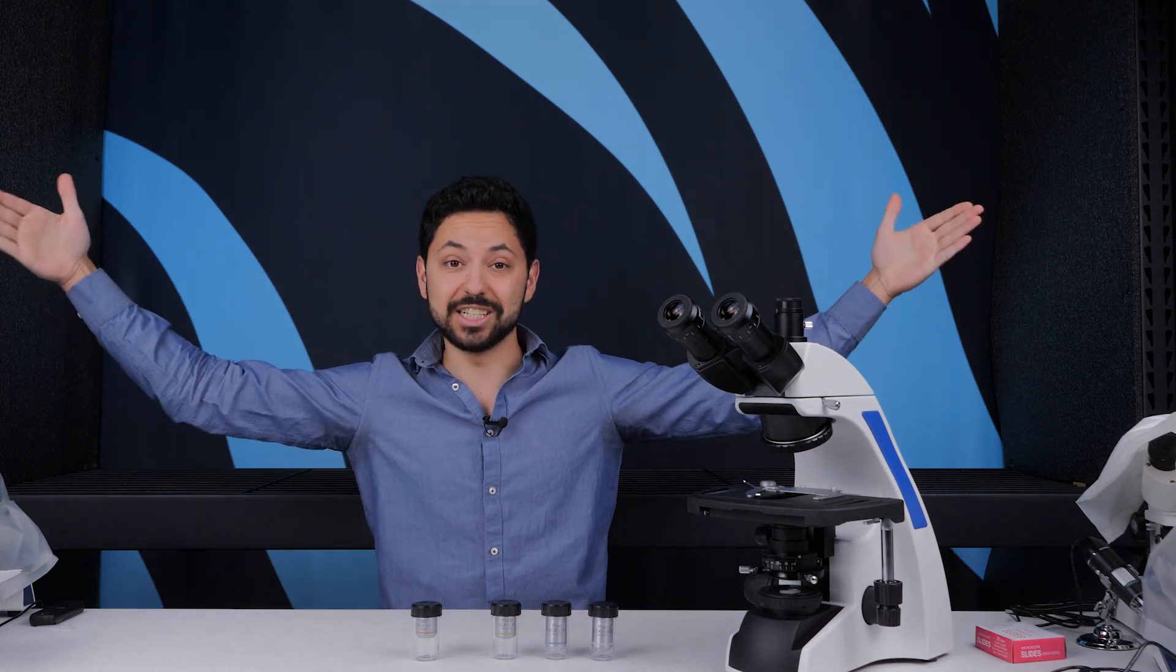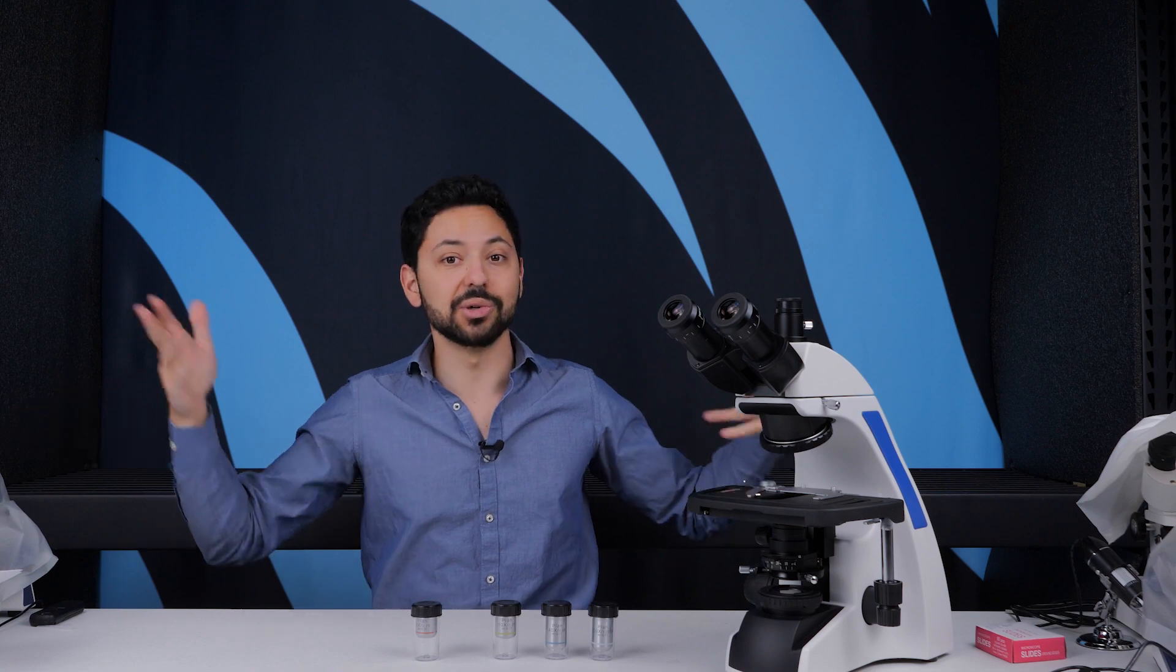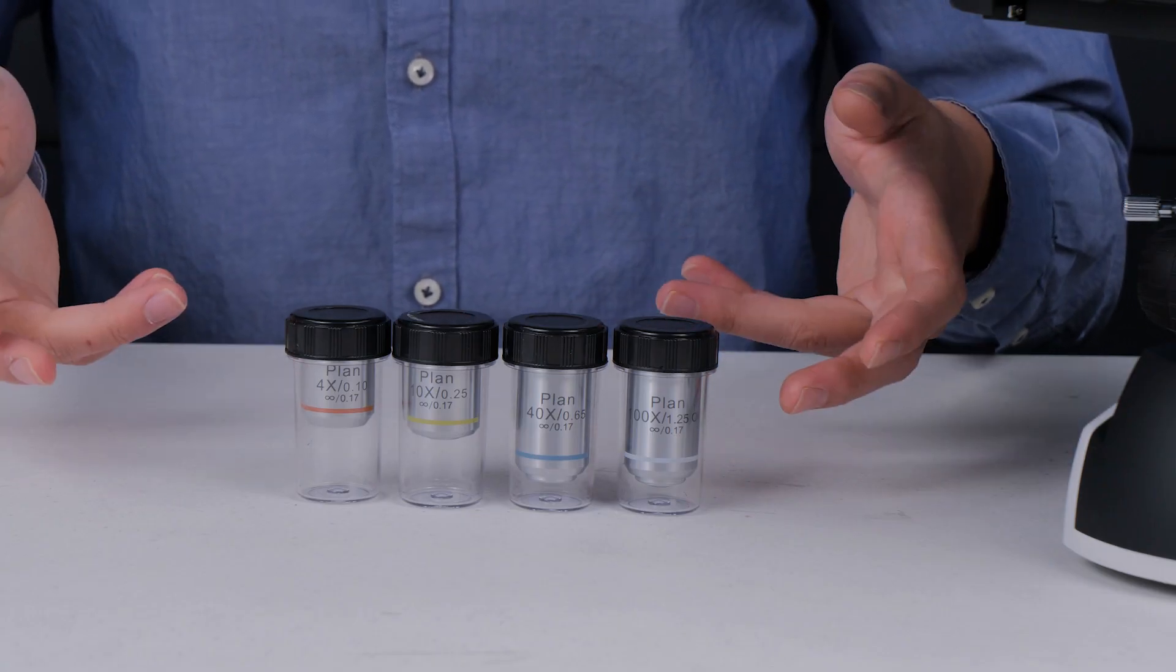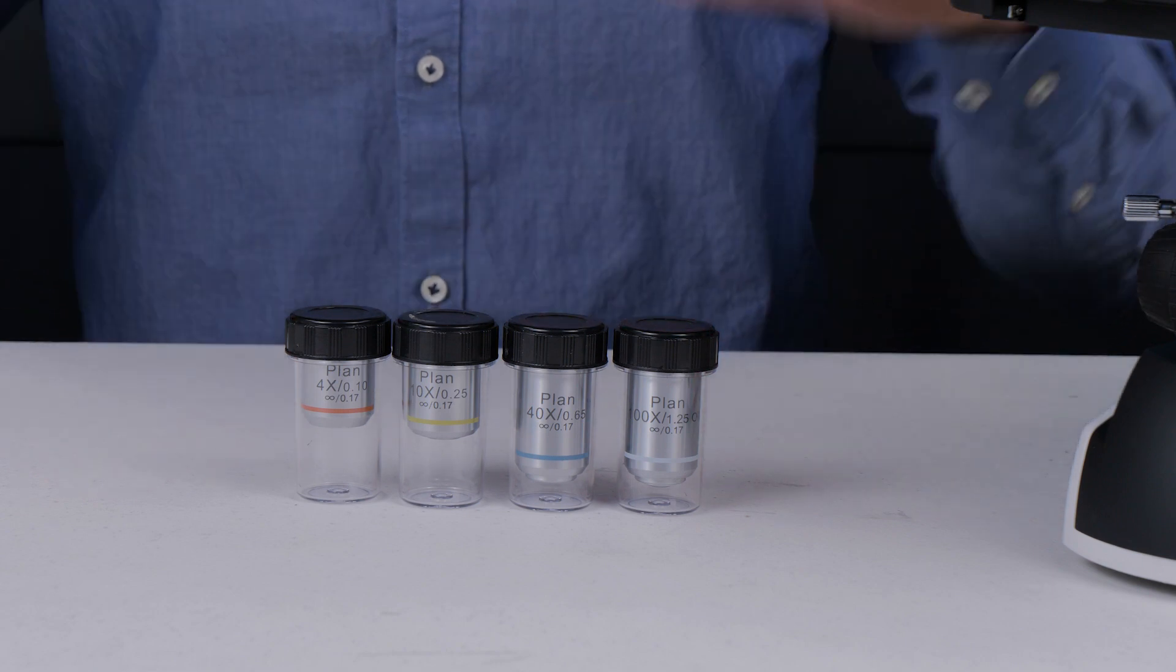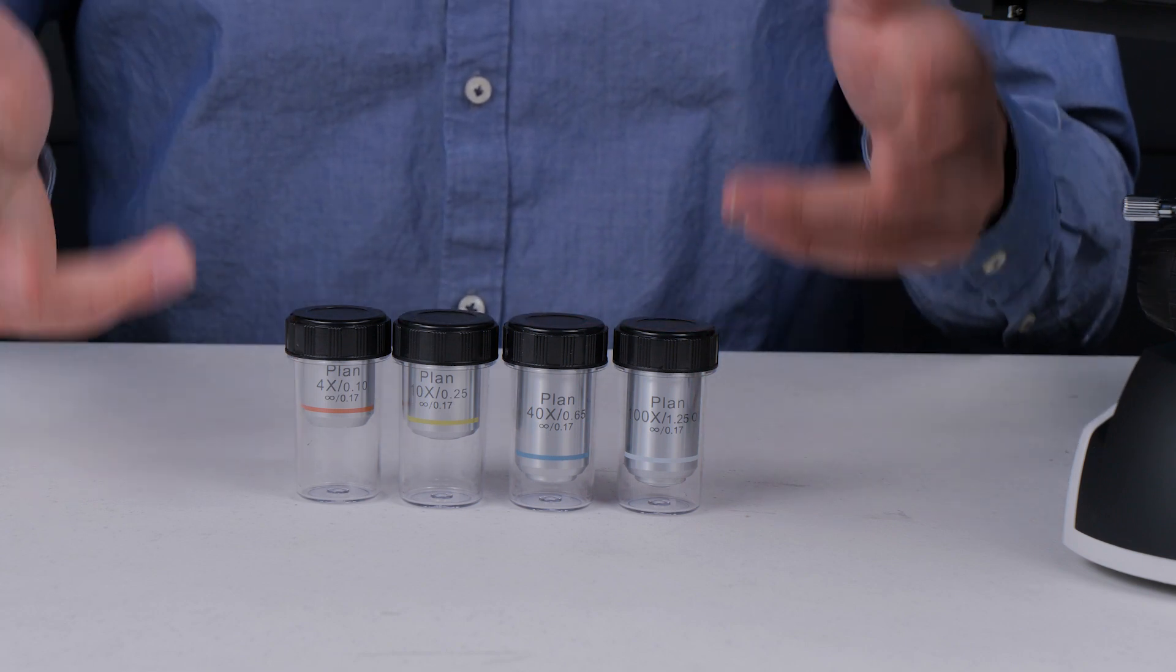If you wanted to see more detail out of that really big TV, you'd have to upgrade the resolution to an 8K display. And it's the exact same thing with magnification and numerical aperture. Magnification is how big the TV is and numerical aperture is what the resolution of the TV is.